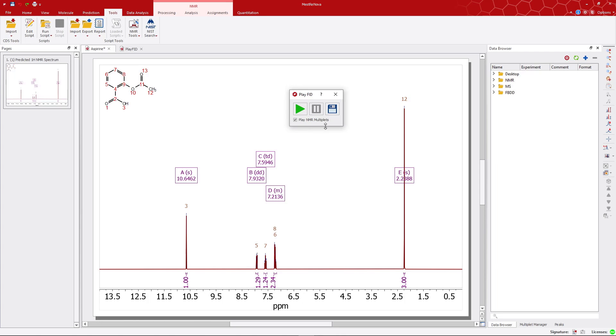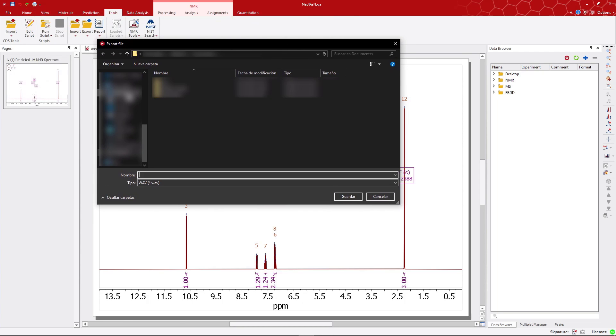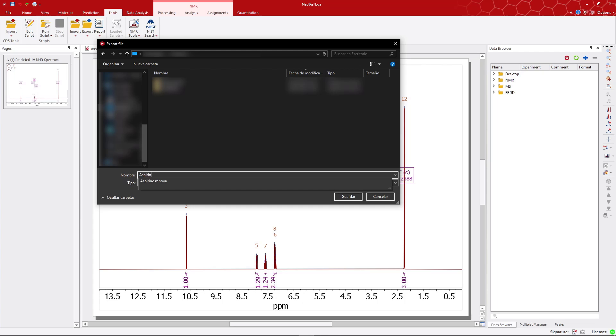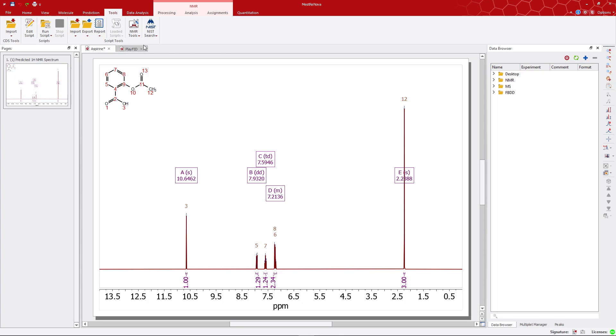Remember that Play FID allows you to export the FID as a WAV file. Finally, can you identify the chords of this stacked spectra?